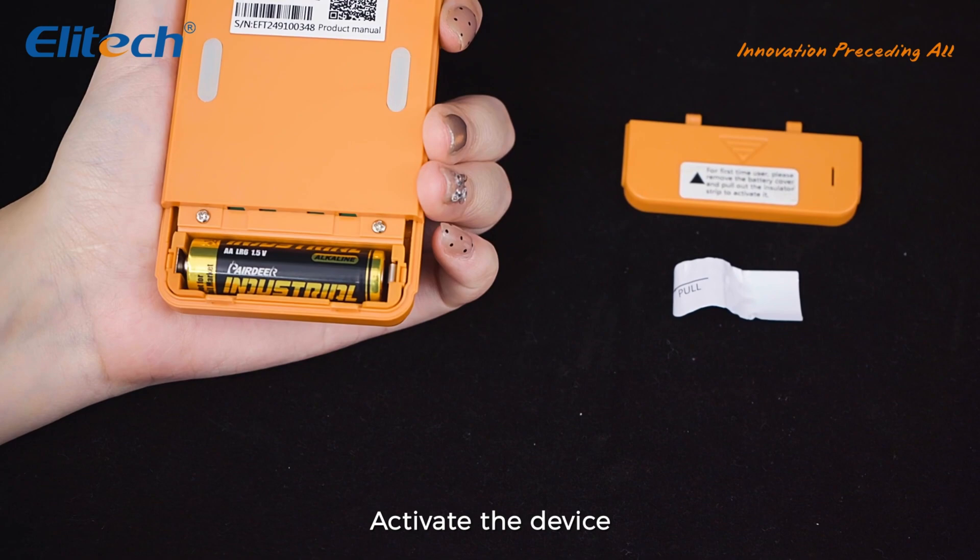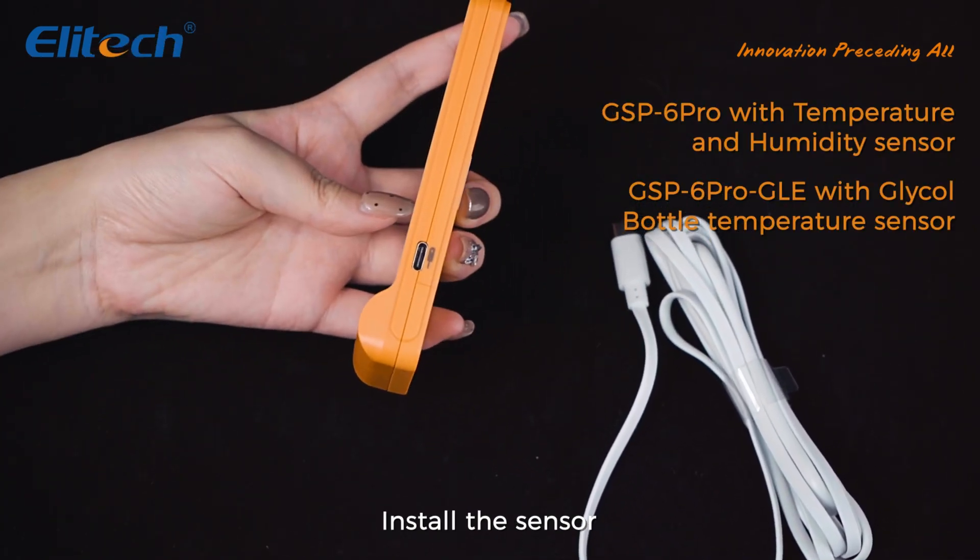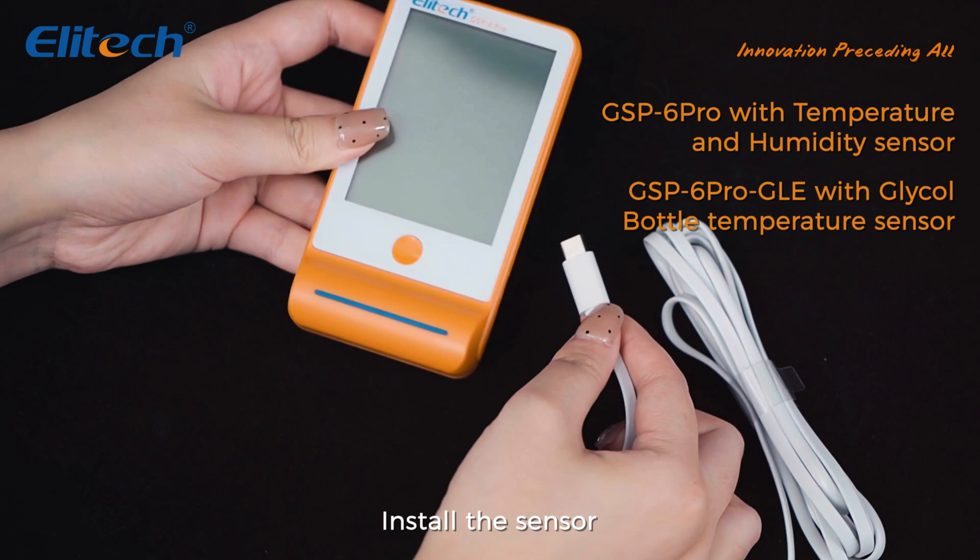Please connect the probe to the interface on the right side of the device. It will automatically recognize the probe type after installation.